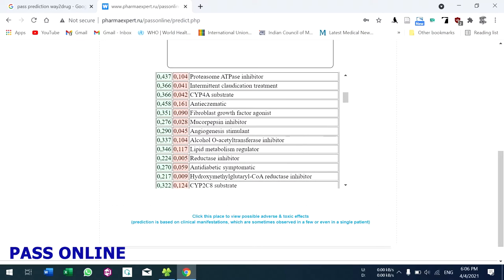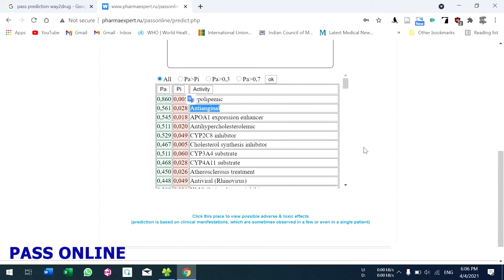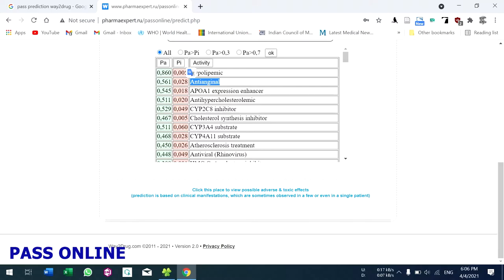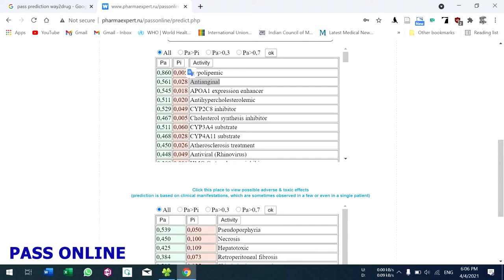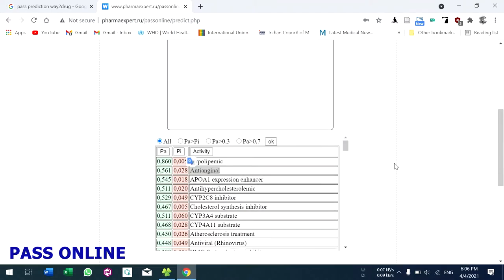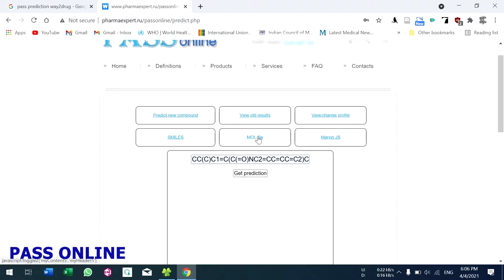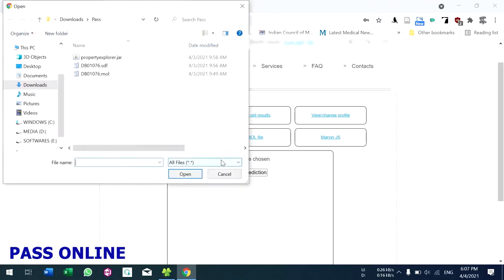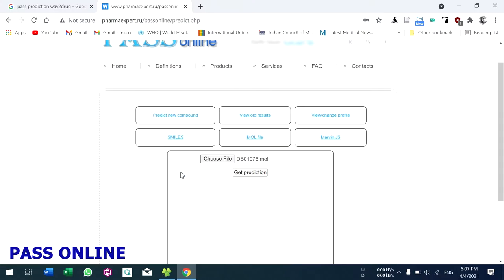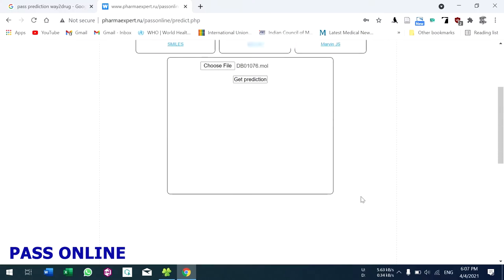If you want adverse reactions and toxic effects, click here. If you have your file in MOL format, click here and upload your file. You can upload an SDF document or MOL format, click open, and then click 'Get Prediction'.